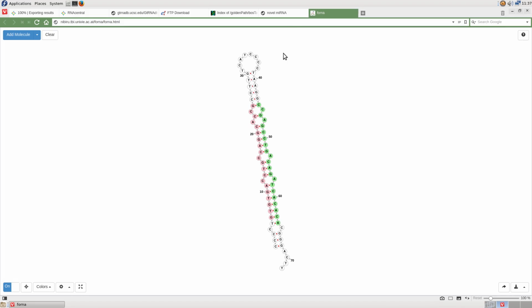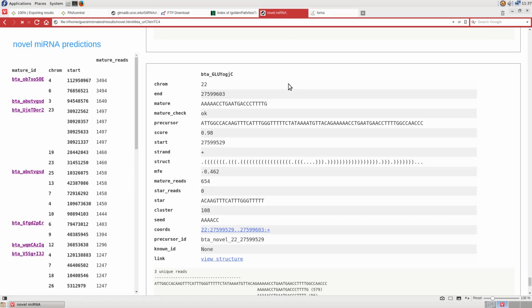So just to summarize, go back to this page. One thing to mention is you can see there's a score value in each table for each microRNA. That refers purely to the score for the precursor structure produced by the feature classification algorithm. And a program like miRDeep2 has a more rigorous statistical model. So our system is more closely based on the miRanalyzer method for microRNA precursor prediction.